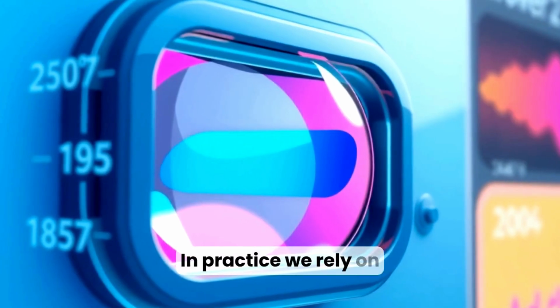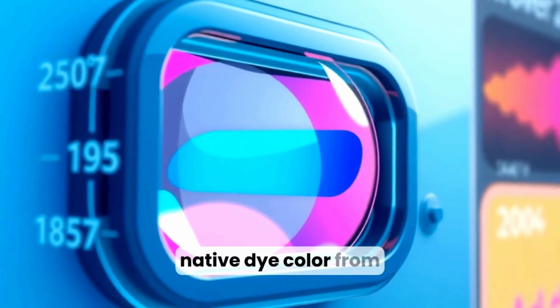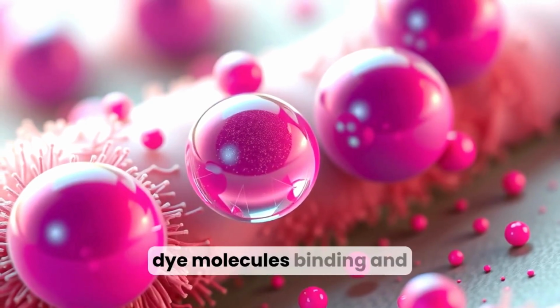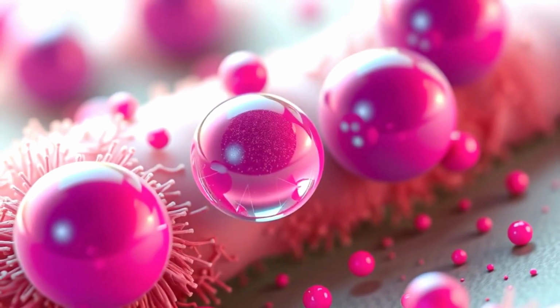In practice, we rely on captions, overlays, and steady close-ups to distinguish native dye color from metachromatic results. Animated sequences that show dye molecules binding and shifting color help trainees grasp the dynamic nature of the effect.